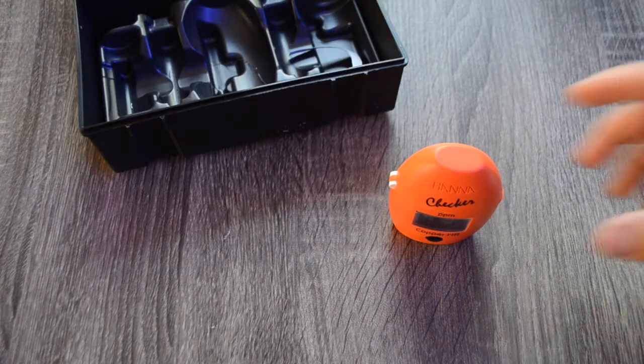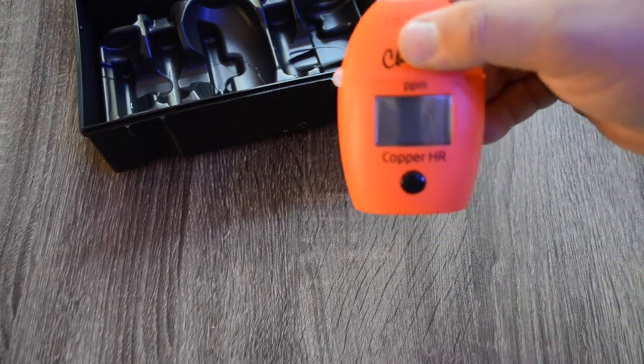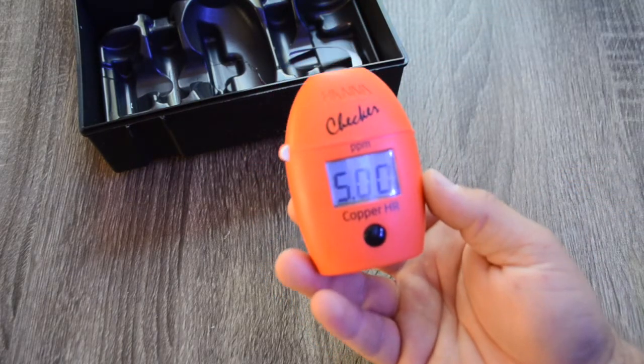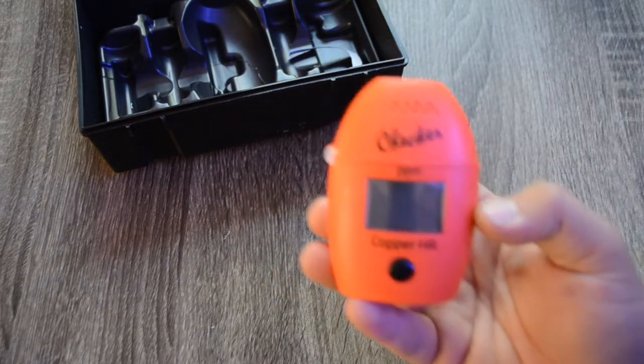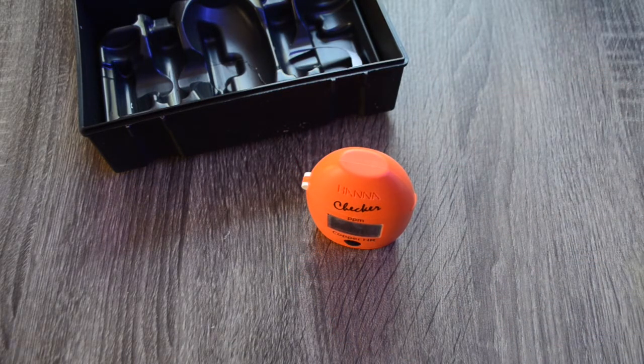It's been 45 seconds and we're getting 5.00 flashing. When you look at your instruction manual, that is telling you that you're over the range of this copper checker and it's not able to read that amount. I'm going to reset and I've watered down my solution a little bit — I'll try one more time to see if I can get a reading within the range of the Hanna checker.